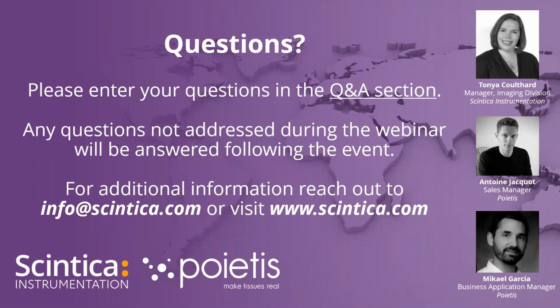And that's the main reason why laser bioprinting is such an interesting technology. Of course you can do a lot of patterning, but you can also preserve cell integrity throughout the process. And to me, it's a very important factor.